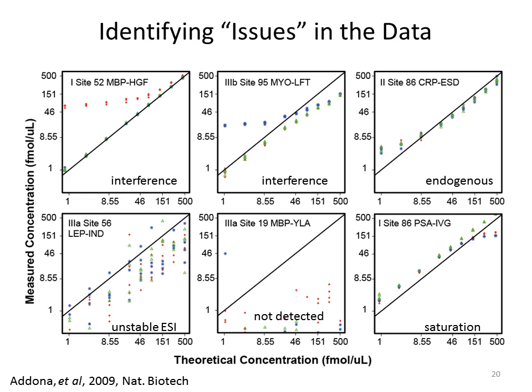And then this one, you would maybe say, oh, it's not detected, but there is a kind of correlation with this. And if you looked at the chromatograms, you would see that the electrospray was very unstable. And what gave rise to this wasn't that it was really jittery, it was that the peak came out in a very narrow window, so we only got 4 points across the peak. And so it wasn't able to appropriately, reproducibly get good peak areas every single time. And so that's the response that you would see in a plot.